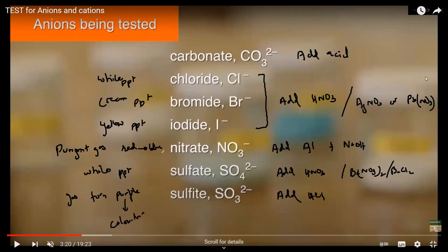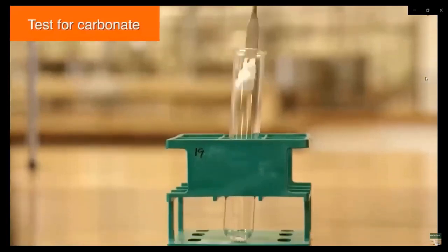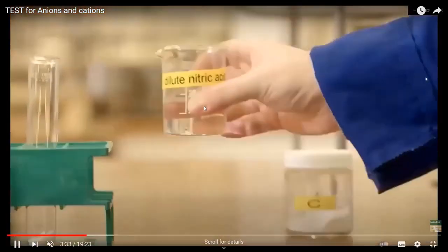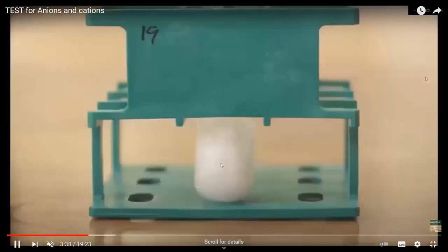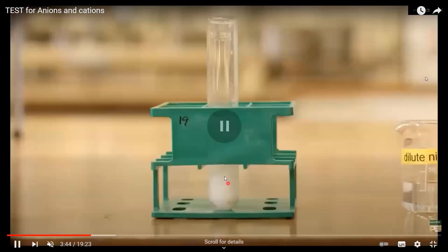So in this video, you will see all the color changes and the observations related to these ions. First example, if we want to test a carbonate ion. How can we test a carbonate ion? This is a carbonate, the salt which contains carbonate. What we did, we add nitric acid. Any acid works. When you add acid, you can clearly see you will observe bubbles. And these bubbles are due to carbon dioxide gas.